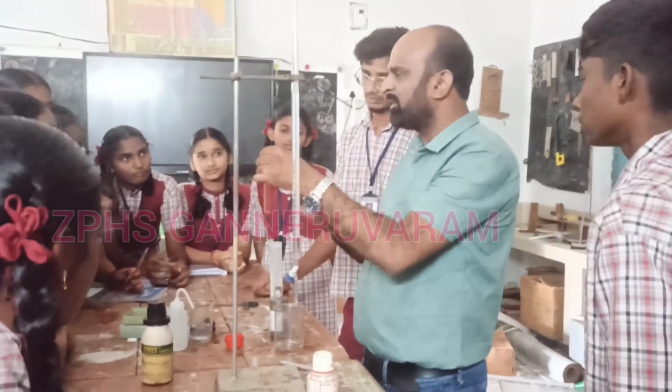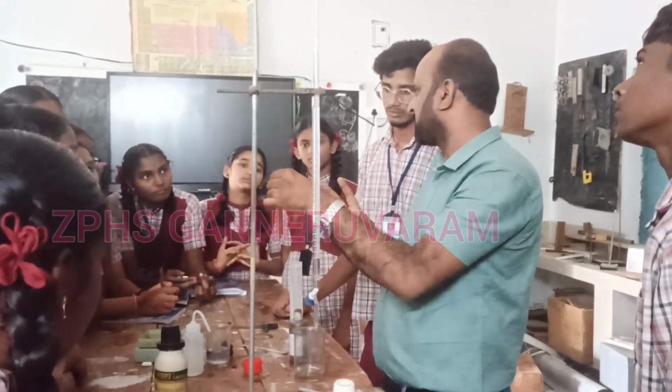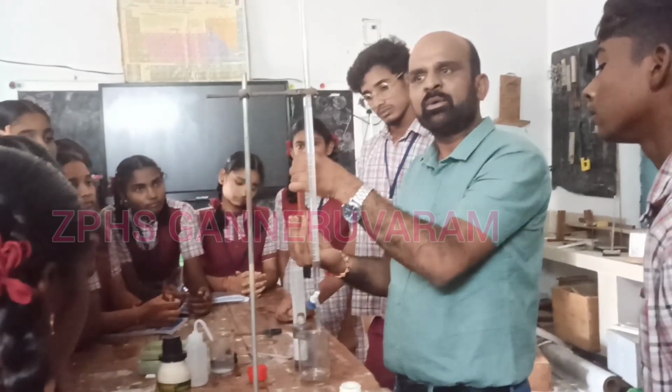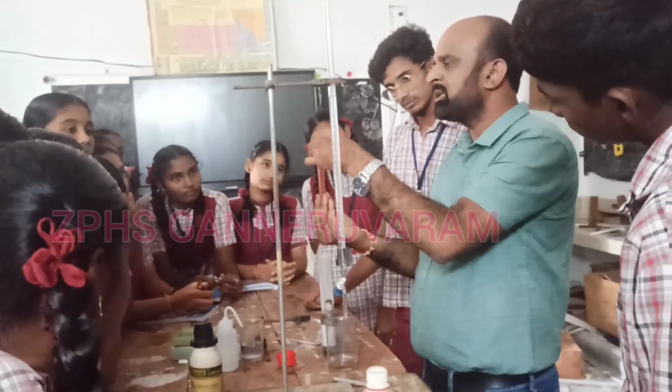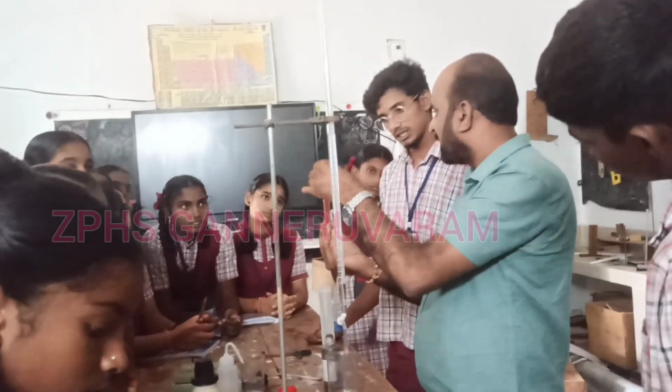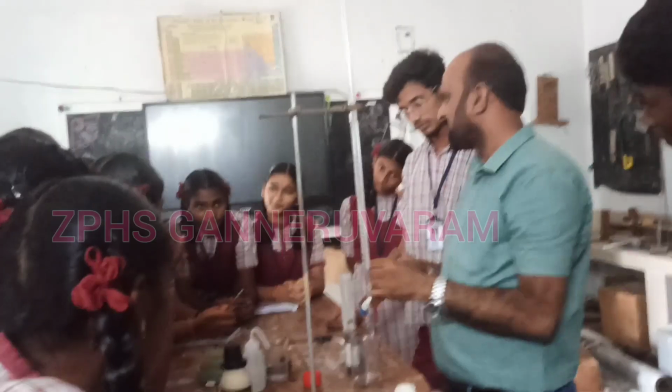Whenever we obtain the red color, the neutralization reaction takes place, and some heat will be produced. If you touch it, you can experience it; it will be hot. So this is the neutralization reaction we have to do.